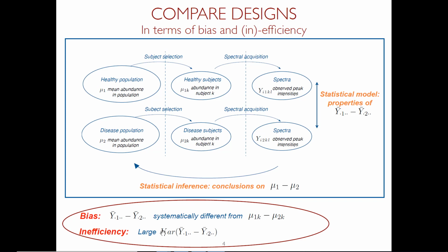So for today, I will assume that the protein is quantified with one peak on the spectrum in one run, to keep it simple. Next week, we'll talk about how to actually aggregate multiple peptide signals and so on for protein quantification. So for today, we just have one number per person, per protein. Okay? And we, in fact, will have one protein for most of the discussion, right? So that's what's going on.